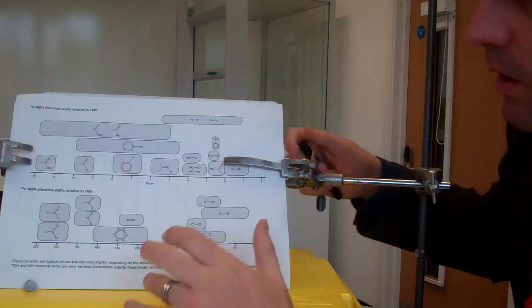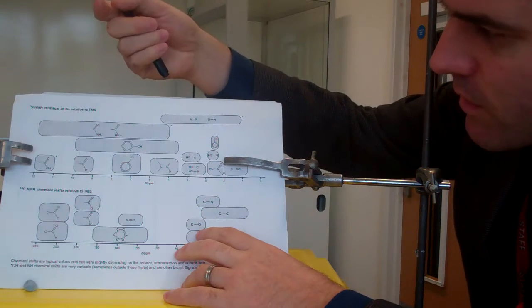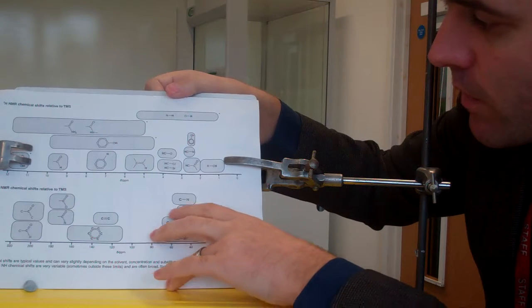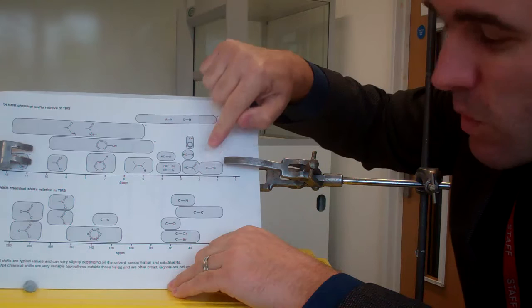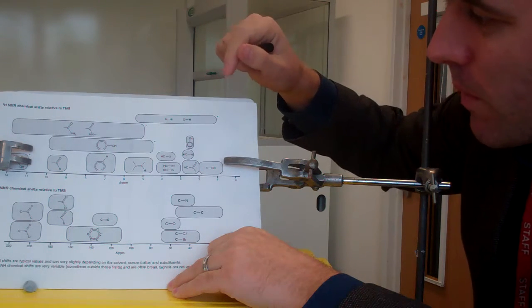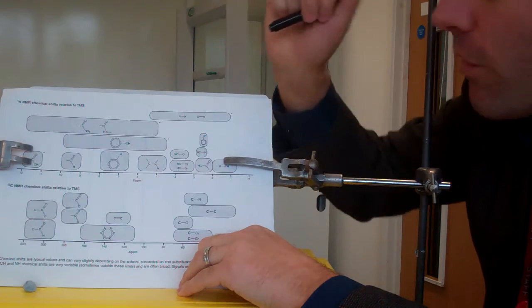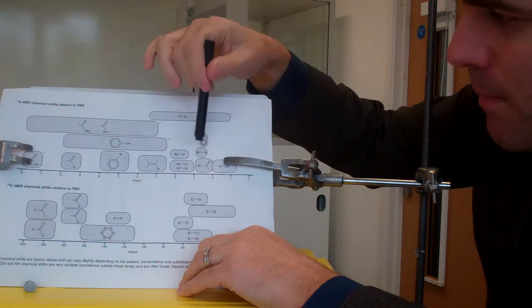So if we look at the hydrogen one first, you can see each one of these hydrogens is in different environments. This one's a hydrogen on a carbon in a double bond. Here's a hydrogen of a carboxylic acid. If we go over here, this is one you probably see most commonly, a hydrogen just bonded to a normal R group, like your normal alkane, a normal alkyl group. We've got here, this is one you see quite a lot, a hydrogen bonded to a benzene ring. So if you get a peak between 6, 7, 8, it quite often will be a hydrogen bonded to a benzene ring. Now you notice quite a lot of overlaps here as well.